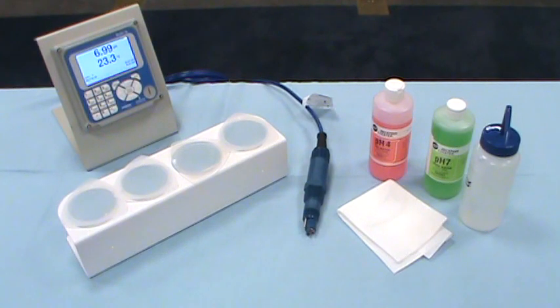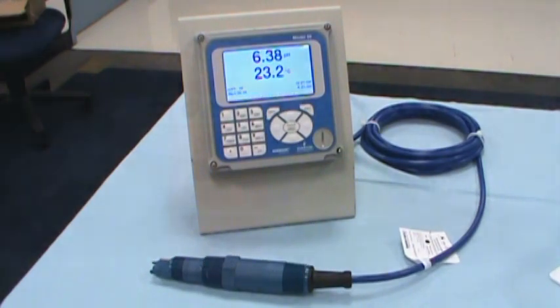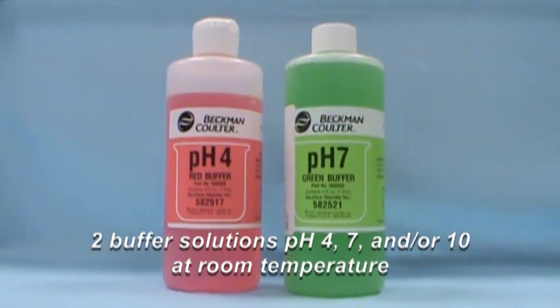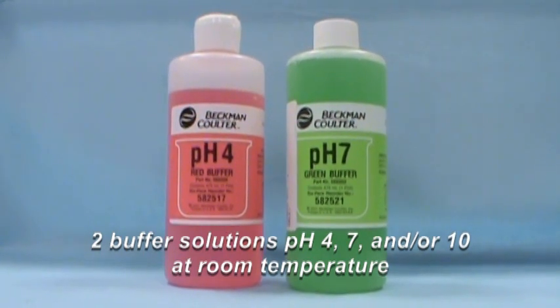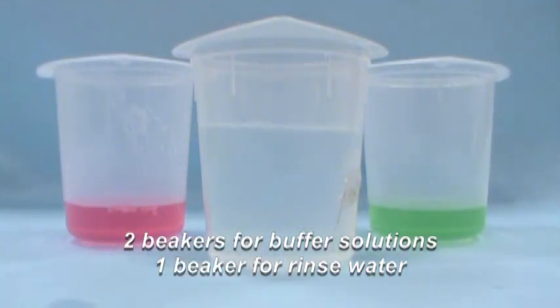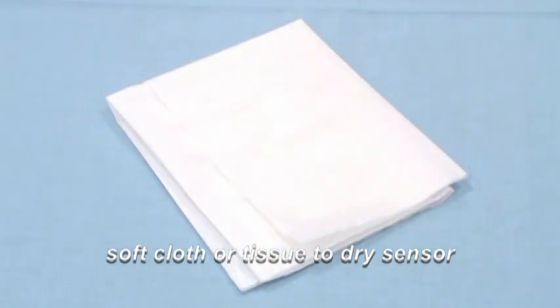To calibrate the sensor, you will need the following: a pH sensor, a pH instrument, two buffer solutions — pH 4, 7, and/or 10 at room temperature, two beakers for buffer solutions, and a beaker for rinse water.